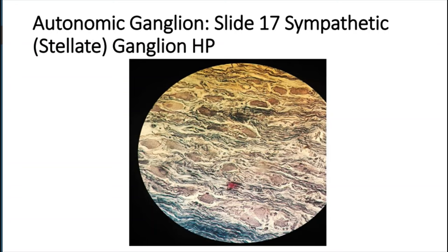So now this is your cell body, and then it has your nucleus here. It has satellite cells as well, and it has your Nissl bodies inside here. And then it is multipolar, so it has a lot of processes. And these that you see here are the nerve fibers, the axonal processes, so you draw them as well.